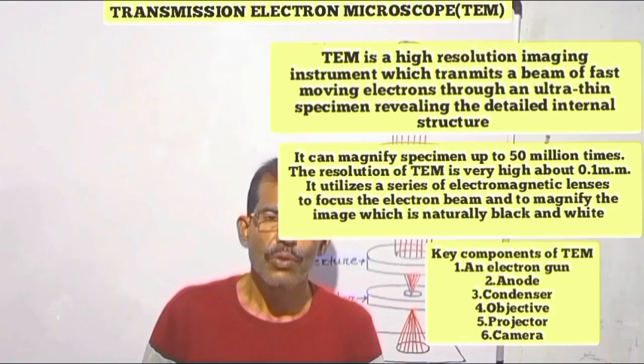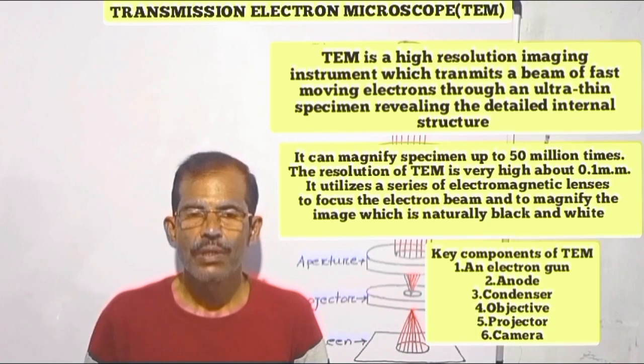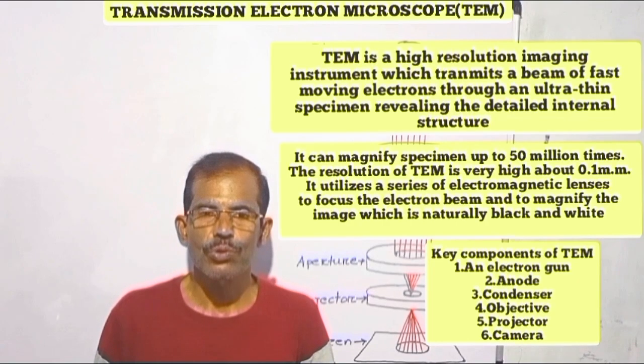Friends, today we will discuss the principle and applications of the transmission electron microscope.